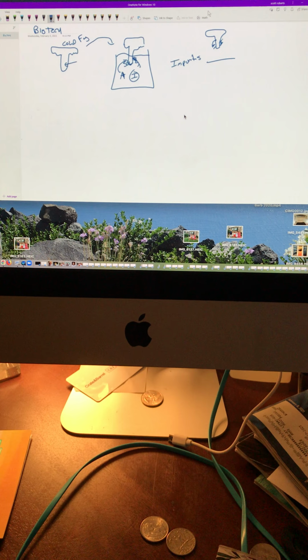Got it? Okay. So what we have here is your impurities can collect here, or your unknown can. So generally speaking, it's your unknown that deposits and your impurities stay behind. So what this implies is you have at least an idea of what your impurities are. So you pull your cold finger out, and the cold finger has all these crystals on it. Remember? And you shave them off. Don't you guys remember doing this? And then you weigh it out, and you're like, oh my God, my yield is like 2%.